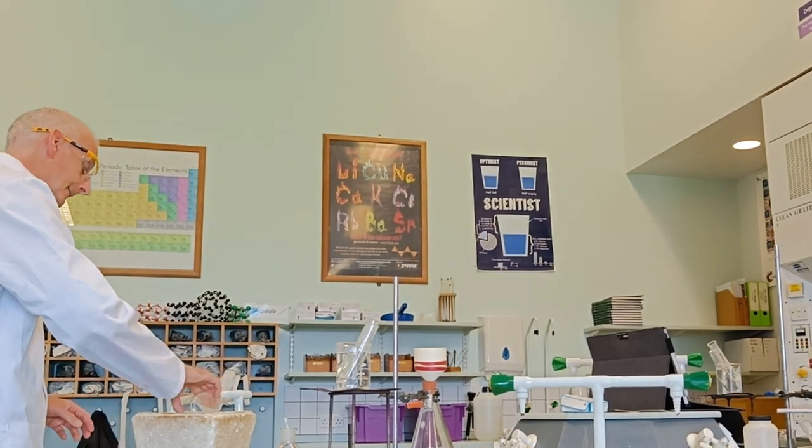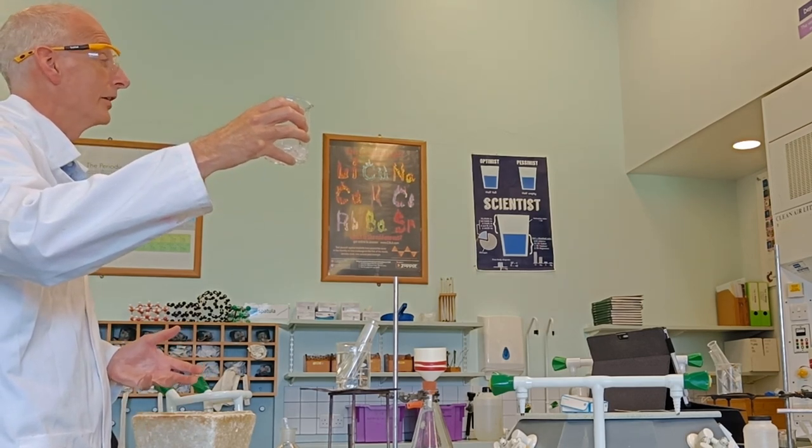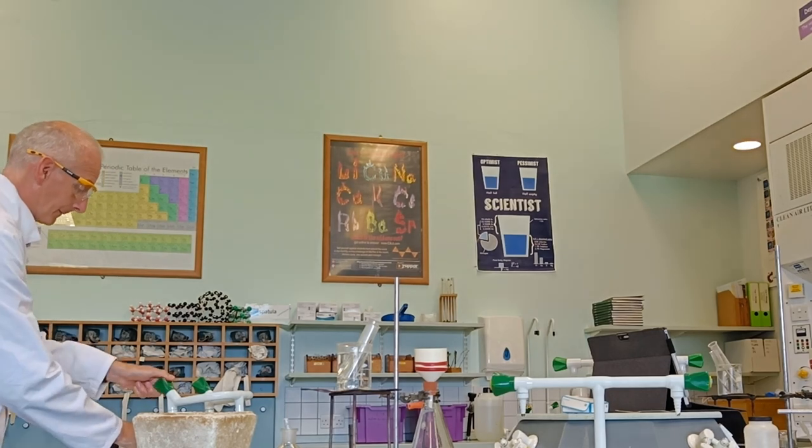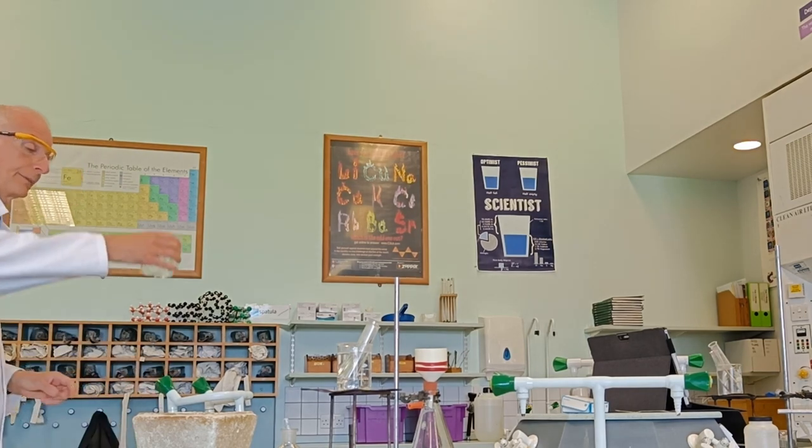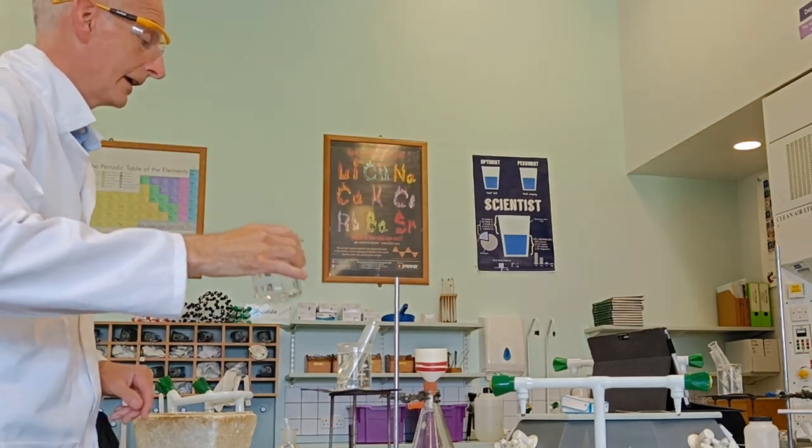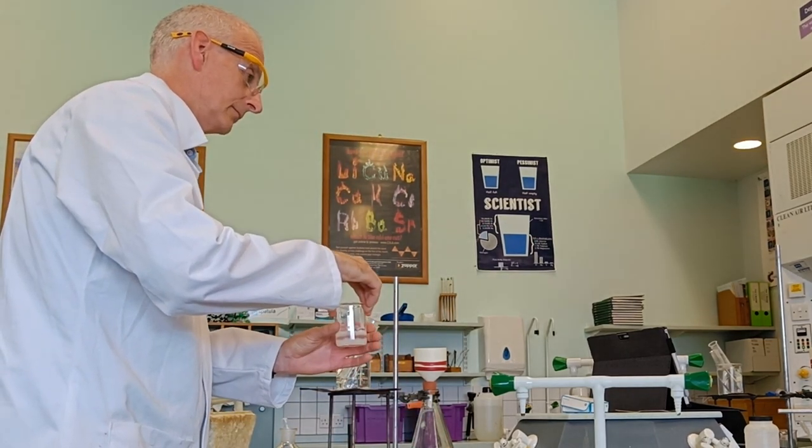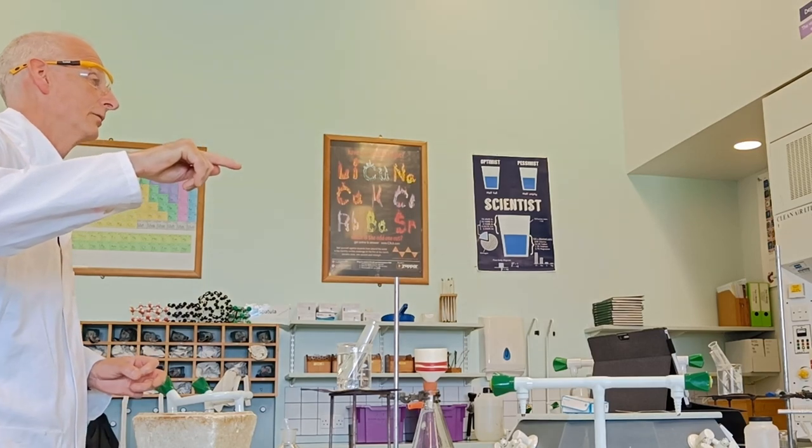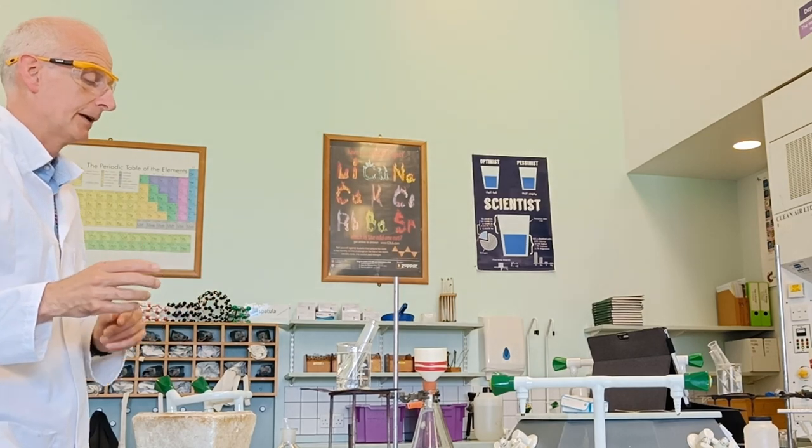I've got some ice here. Take a little bit, not much. You know when you go to McDonald's and they give you mainly ice and a bit of Coke? We want it the other way around - a teeny bit of ice and lots of water. This is called a slush bath. You can see there's just a little bit of layer on top there. This is eventually going to cool this thing in there. This is going to drop the temperature even lower, and therefore the stuff is going to be even less soluble. So even more crystals are going to form. I can maximize the yield of pure stuff here by cooling as much as possible.